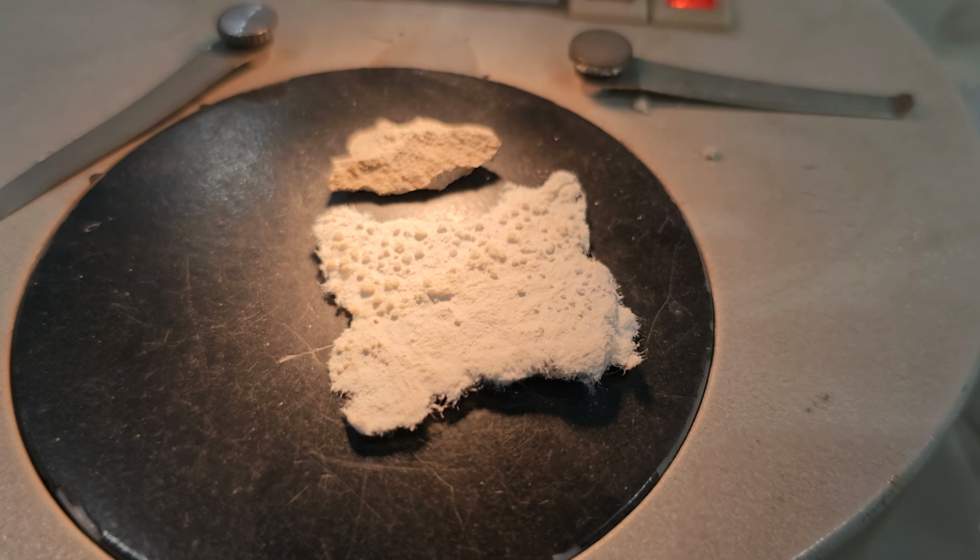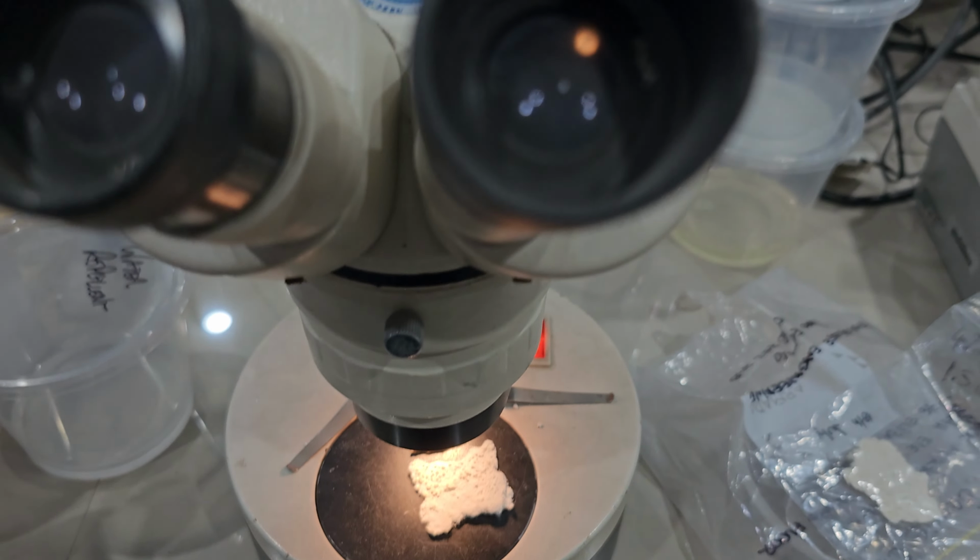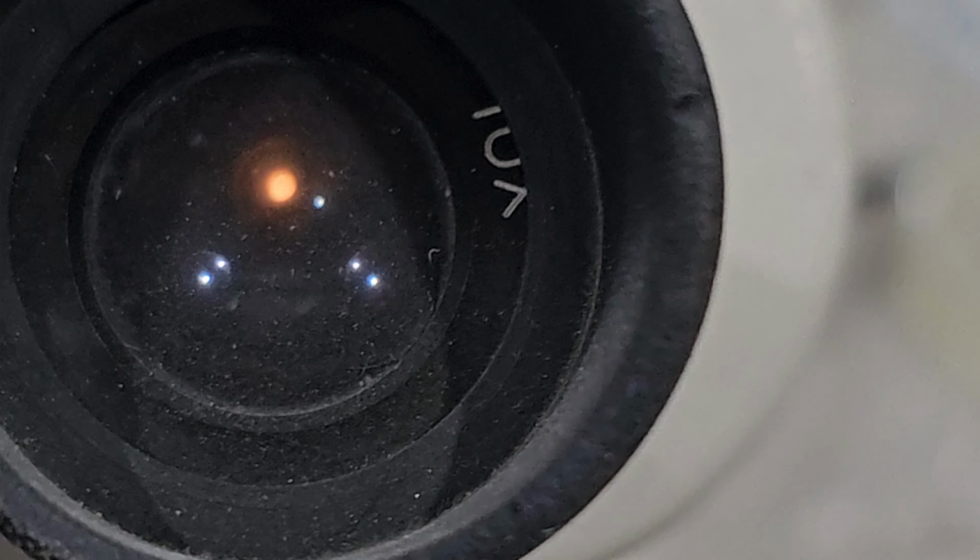equipment here. You can see the salts have gathered on the surface of the Cocoon there, and if you bear with me while I get this camera to focus through here, you can see the salts growing on the surface of the paper there.